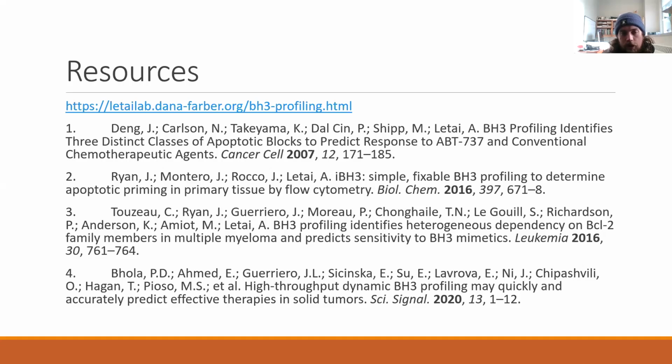But in most cases, I find digitonin works fine, and used at the appropriate concentration, every cell is appropriately exposed to the peptides. Thank you. And that's why you have your controls and stuff to confirm that. Because if I'm not seeing a response in my controls, because every well was given the same cell, then that's one of the potential areas that it could have gone wrong, is that the cells weren't permeabilized appropriately.